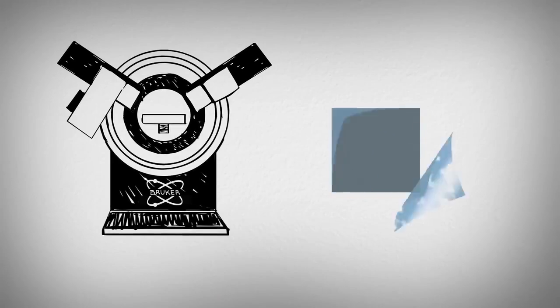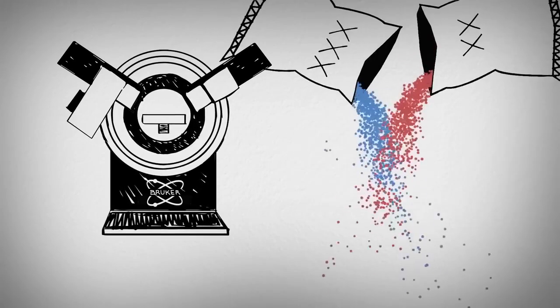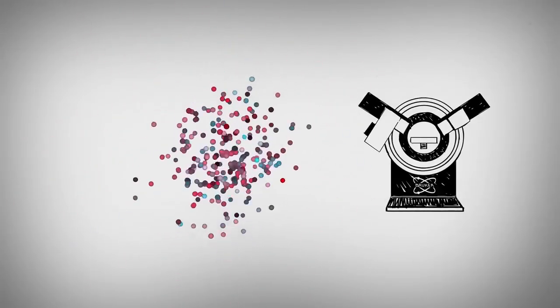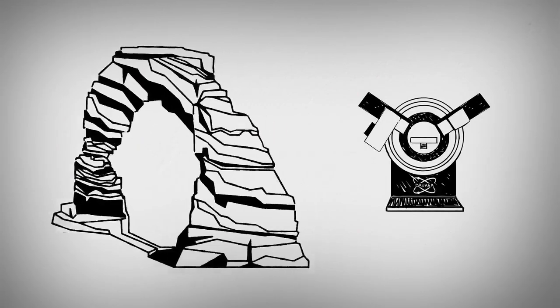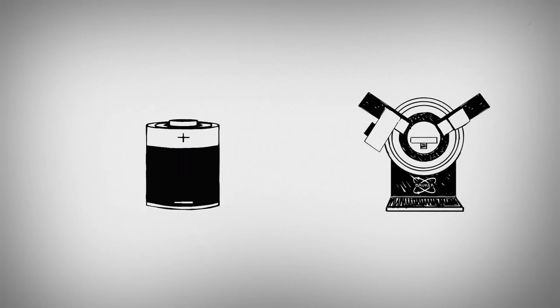This technique of X-ray diffraction is used today for a wide variety of materials, ranging from single crystal epitaxial thin films to polycrystalline mixtures of powders, and even randomly oriented amorphous materials. X-ray diffraction helps scientists to develop new pharmaceuticals, classify rock formations based on their mineral components, and understand how the arrangement of atoms affects the behavior of energy storage materials.